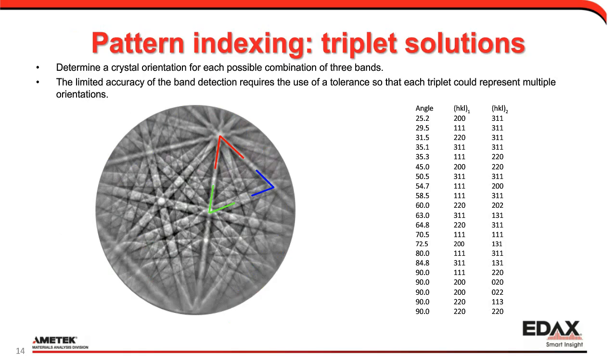Now, what we do with all this is I say, okay, I have what we call these triplet solutions, where I'm looking at the angles between different things, and here I have these angles, and we're good, right? So here's my red one, here's where my blue one could be, and this is the other one. Now, why have I opened up the angle, so that instead of one exact choice there is more than one? That's because there are errors being propagated through all of this.